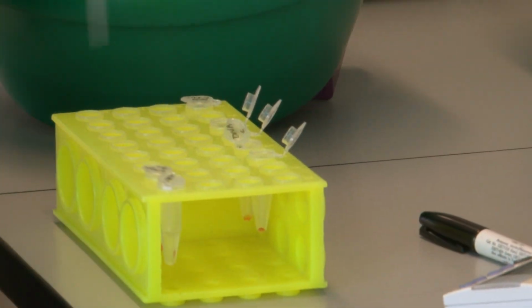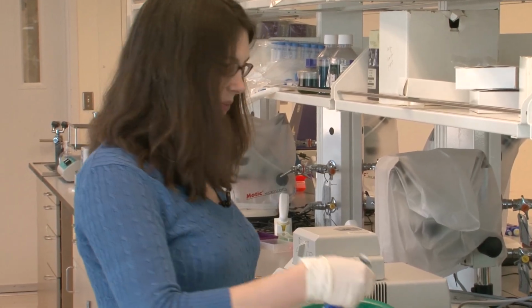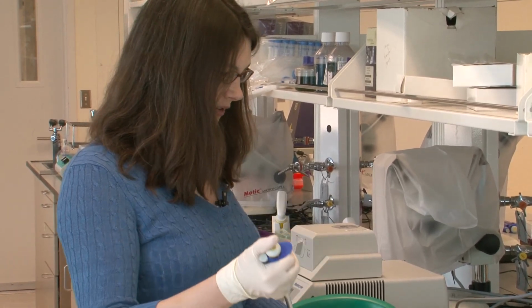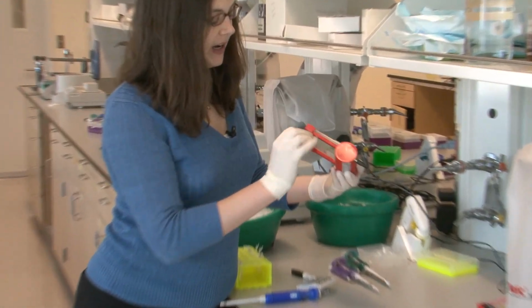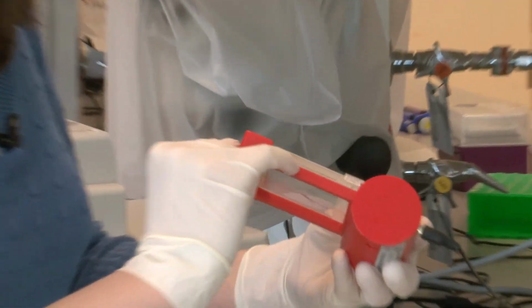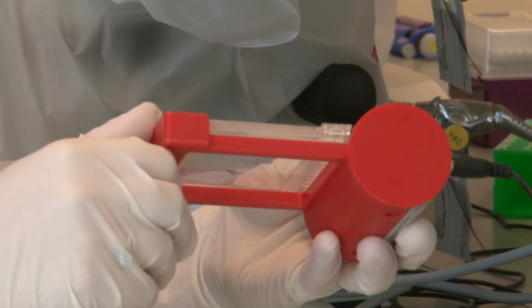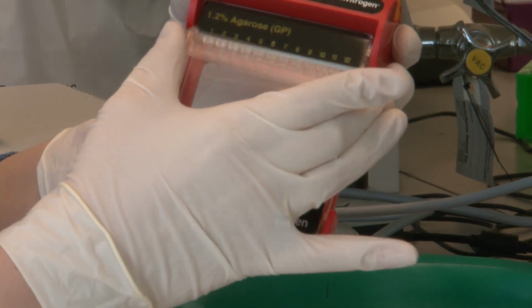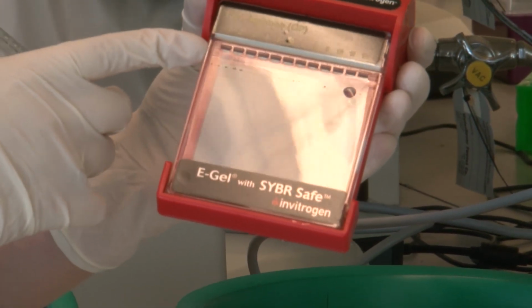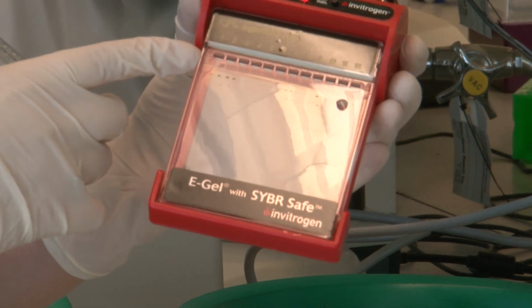Okay, so now that we have all of our DNA samples to load onto the gel, I'm going to load them onto the gel. The way that works is that this is your slab of gel right here. If you can see from the side, the gel is actually coated in 2 pieces of plastic, but the opaque substance in the middle is the gel matrix. Now this gel right now has a plastic comb in it that's protecting 12 holes in the gel. We can load each DNA sample into one of these holes.